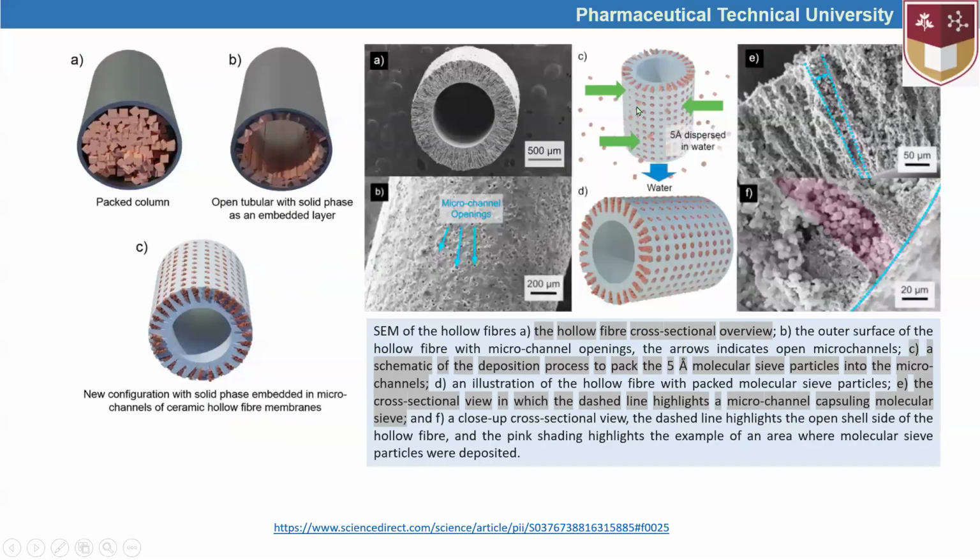Here we can see some model examples and SEM figures of how the inside of the column looks like.